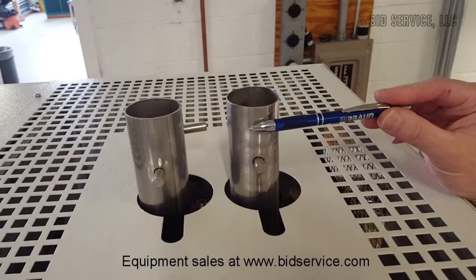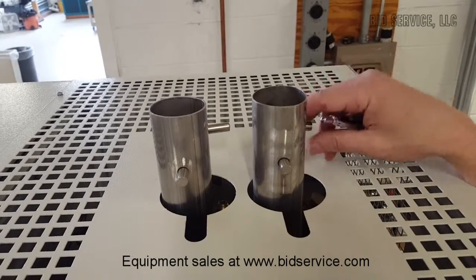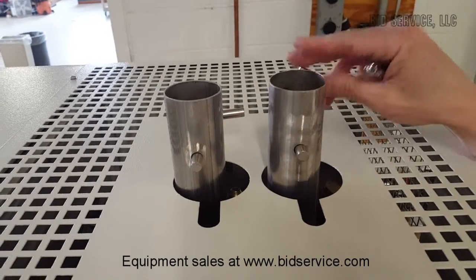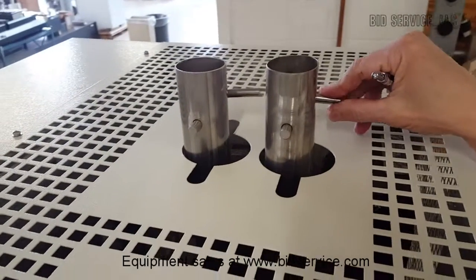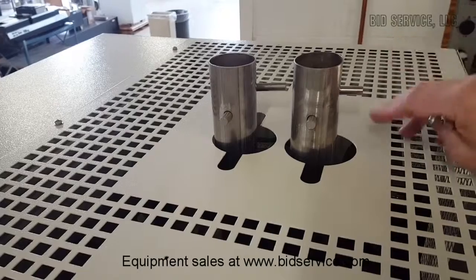Up top here you have an intake and an exhaust damper leading into the chamber. You can adjust it — this is open or closed at 90 degrees — by adjusting those levers.